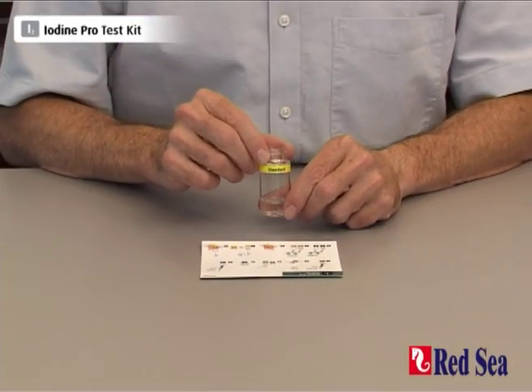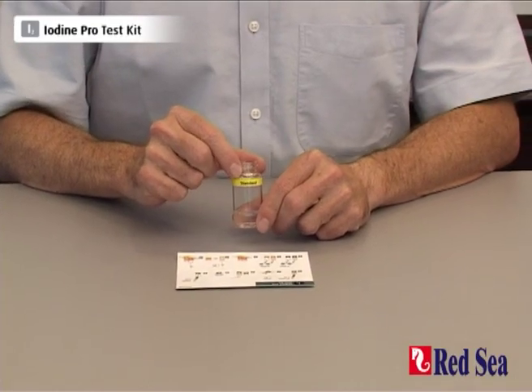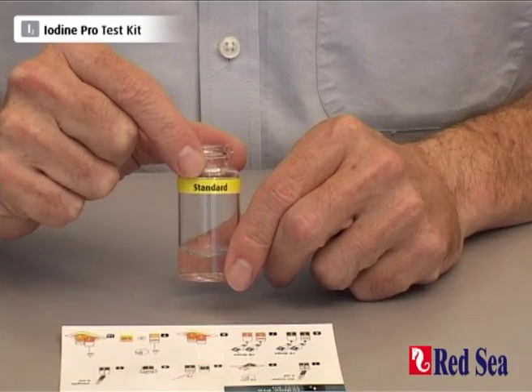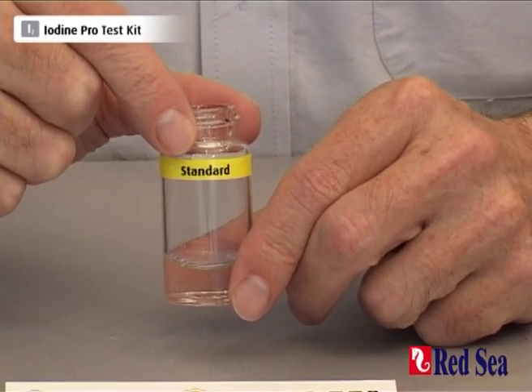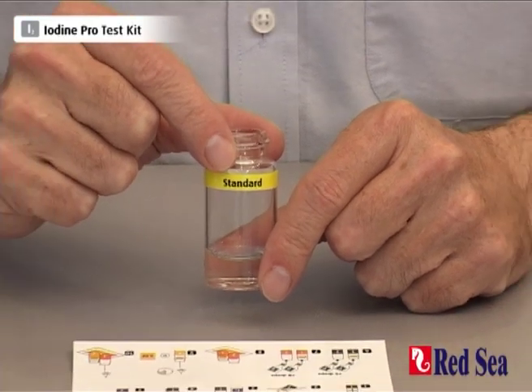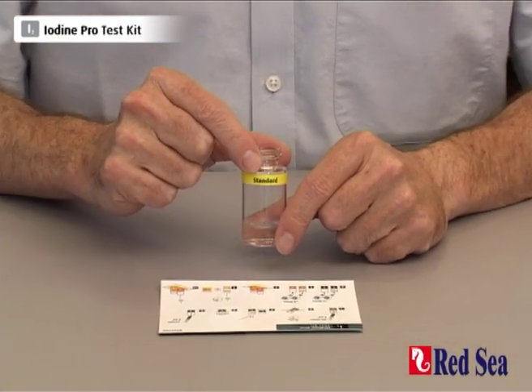The first part of doing this test is preparing a vial with a standard solution of iodine. You have to take 5ml of reverse osmosis water and leave the vial floating in your aquarium for about 10 minutes for it to get to the same temperature as your aquarium.